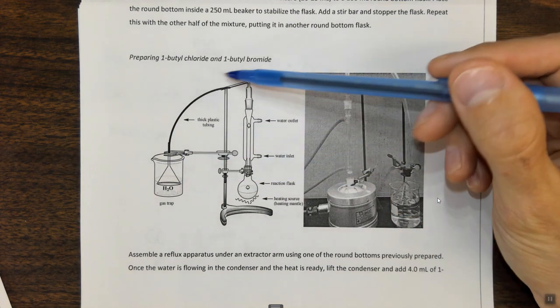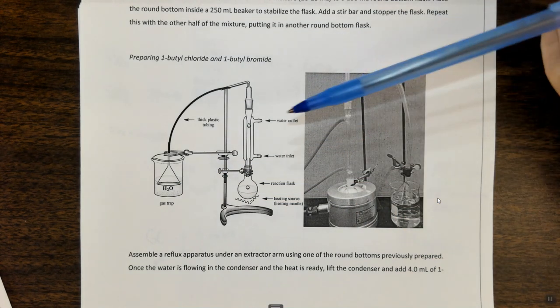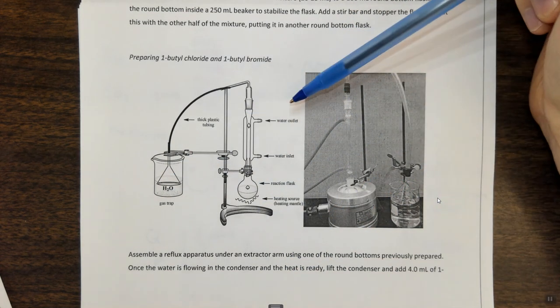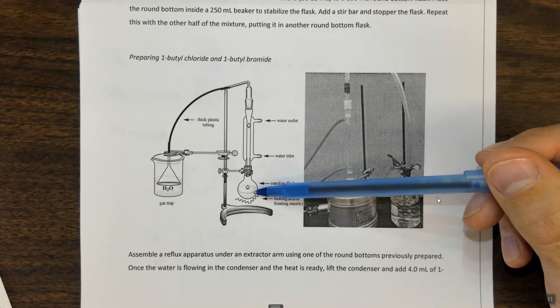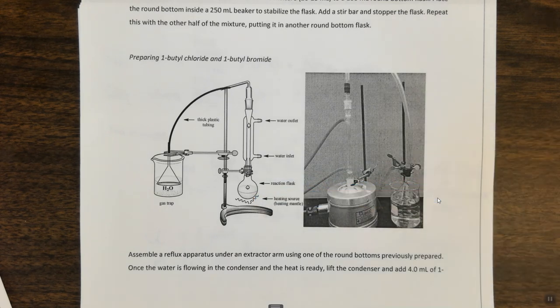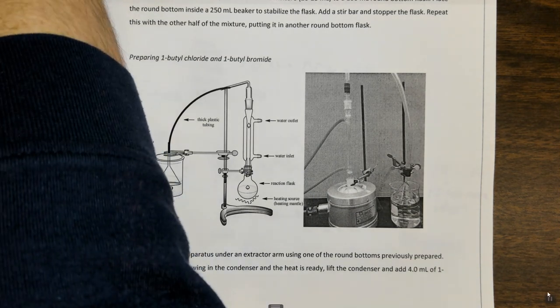What's going to happen is any gas that comes out of here is going to bubble through water, and that should dissolve hydrochloric and hydrobromic acid. If it dissolves in the water, that's a lot better than you breathing it in. So make sure you have this all set up. Once you have this set up and you have your nucleophilic mixture here, before you start heating it, you're going to add 4 milliliters of the 1-butanol in order to get the reaction to go.